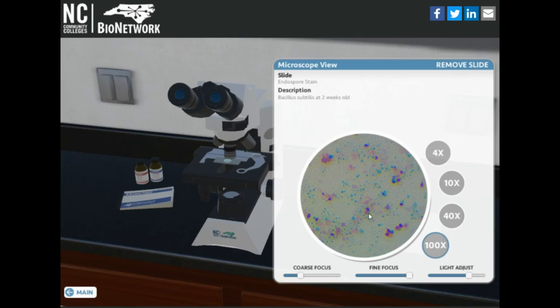And so as I'm thinking about this, it's probably these little purple things that are going to be your positives. I don't think the blue ones matter. But I'm not 100% sure. On that front, well, we'll get to that in a second.